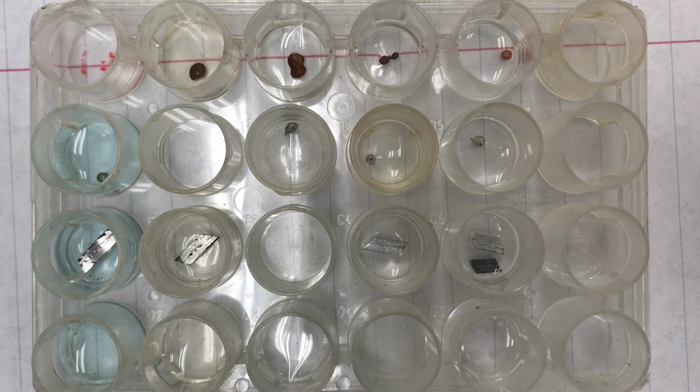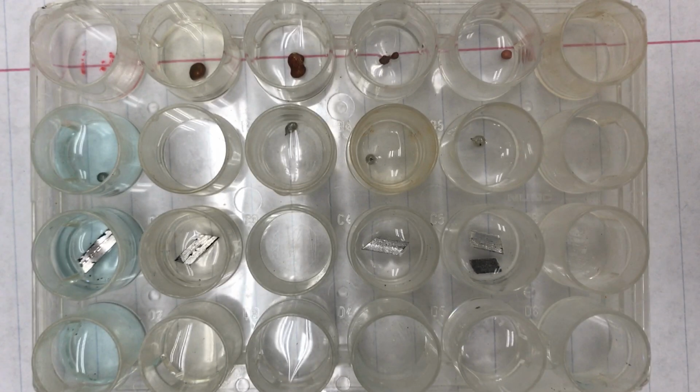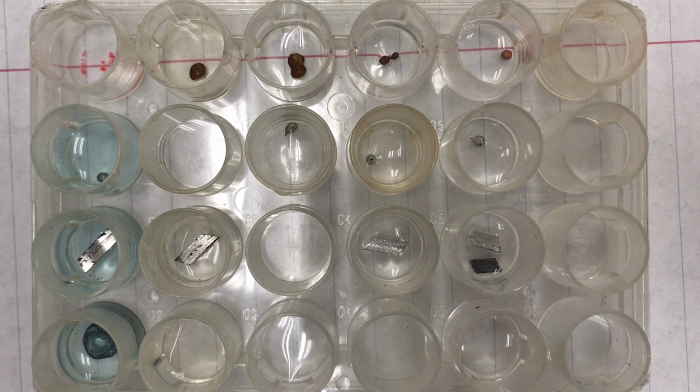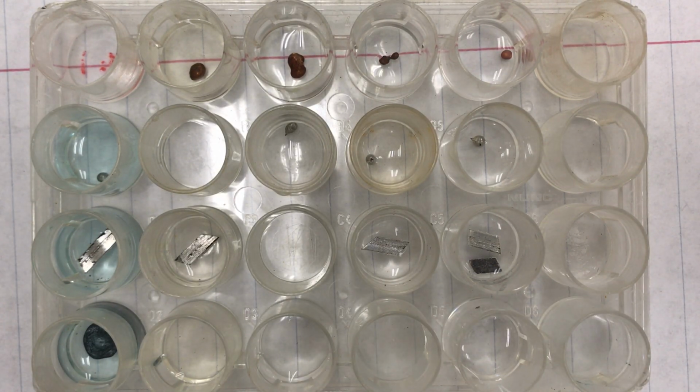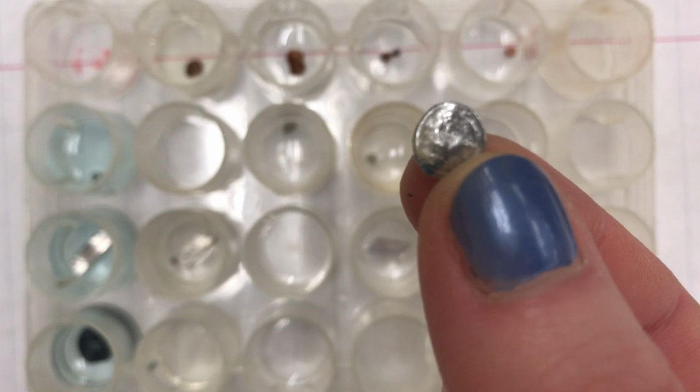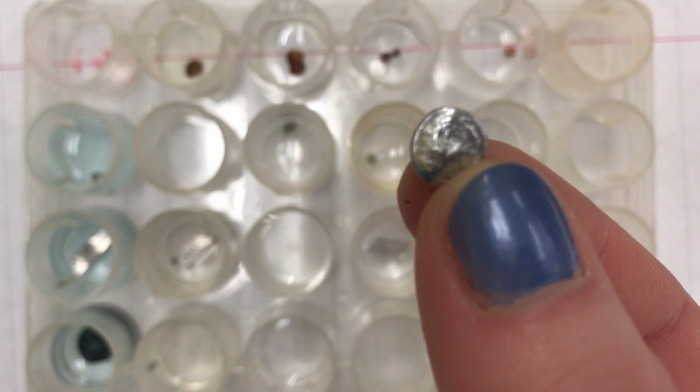And then we're taking zinc and putting that into row D. And there you can see that was a fast reaction down at the bottom corner. We're starting off here with this guy, it's silver, so make a note of what it looks like beforehand.